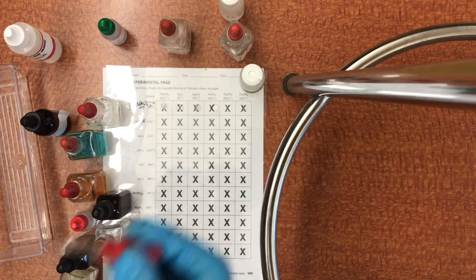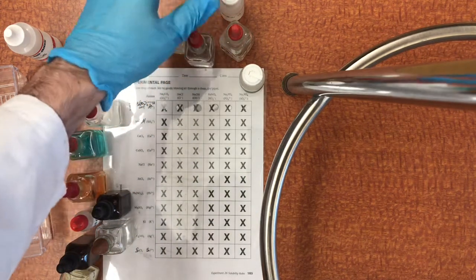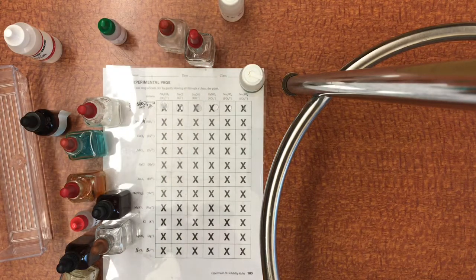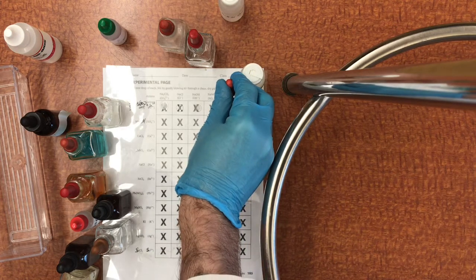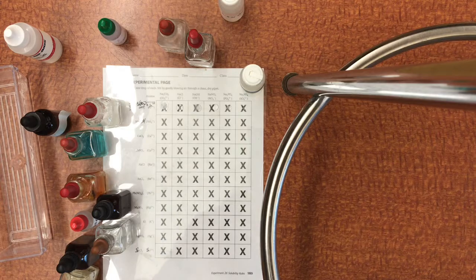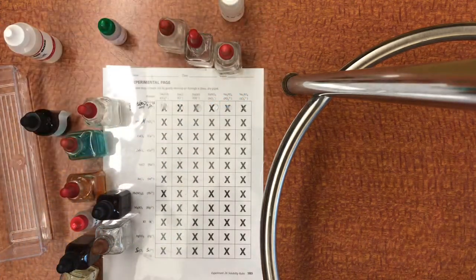I've got nitric acid instead of sodium nitrate, so hopefully that'll be okay. Now I shouldn't get any reaction because this is actually making barium nitrate again. So barium nitrate and sodium nitrate should give me the same result. Okay, let's try the phosphate. And we do see some clouding there. So that's barium phosphate being formed.